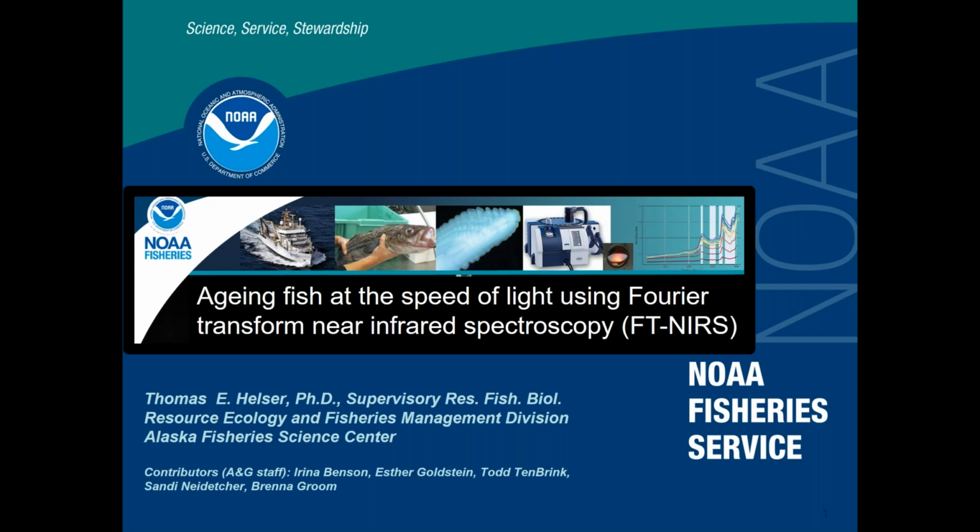From the title, you're probably scratching your head saying, well, can you really age fish at the speed of light? And well, the short answer is no. Not too surprising there, but truth be told, we're employing a technology that has ability to substantially increase the efficiency of aging fish through the interrogation of otoliths using Fourier transform near infrared spectroscopy.